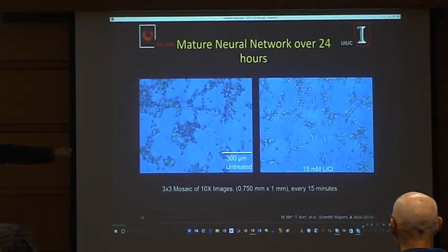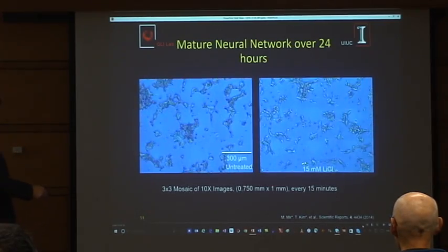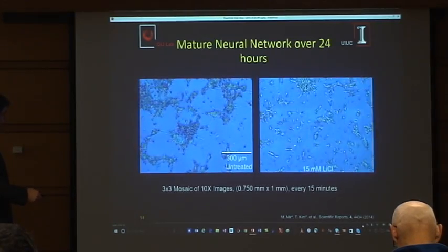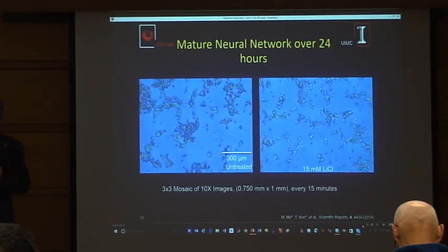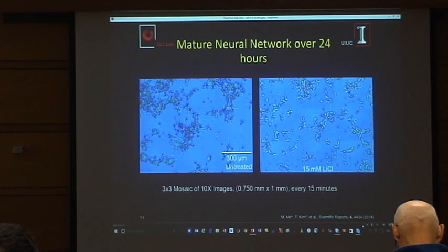And then they find one, extend, boom, snap in place. And we did a control experiment where we treated the cells with lithium chloride. And notice that the cluster size is much smaller. This inhibits that growth, so they cannot produce the protein that allows them to shake hands.